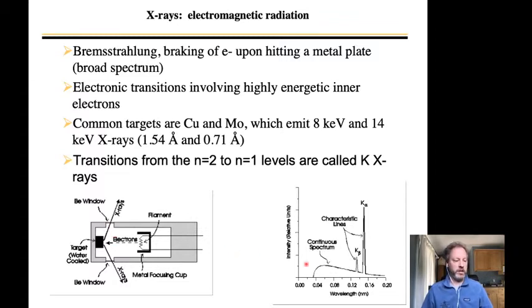There's continuous radiation. This continuous spectrum of X-rays has to do with the electrons as they hit the nucleus, or are accelerated or curved by interaction with the nucleus, or slamming into the nucleus and coming to a complete stop. That releases white X-rays, just broad spectrum X-rays that are released without sort of a focused beam.